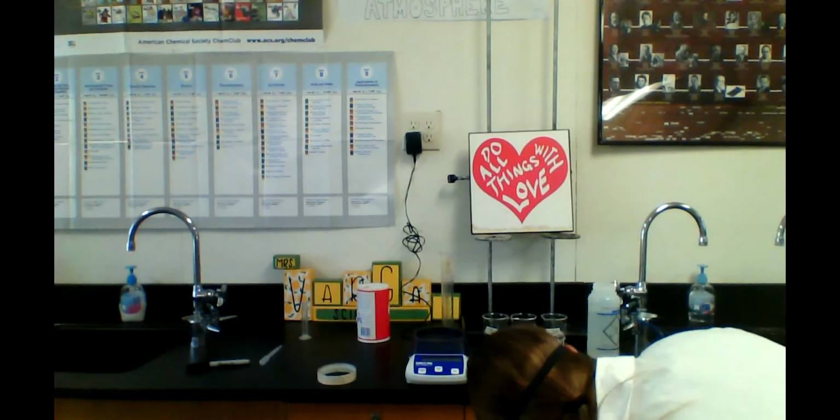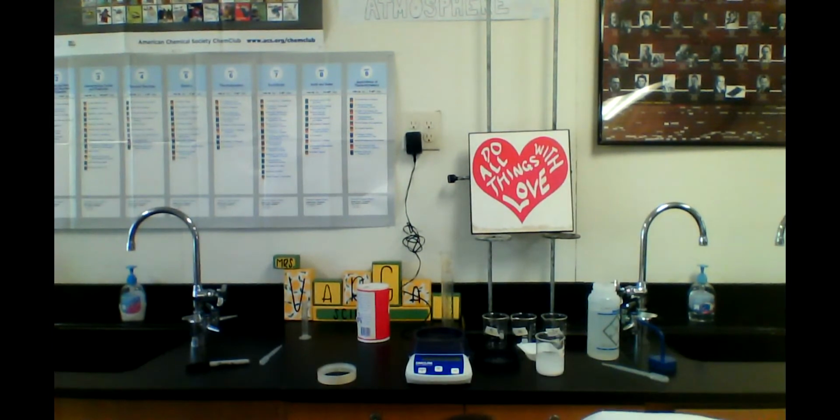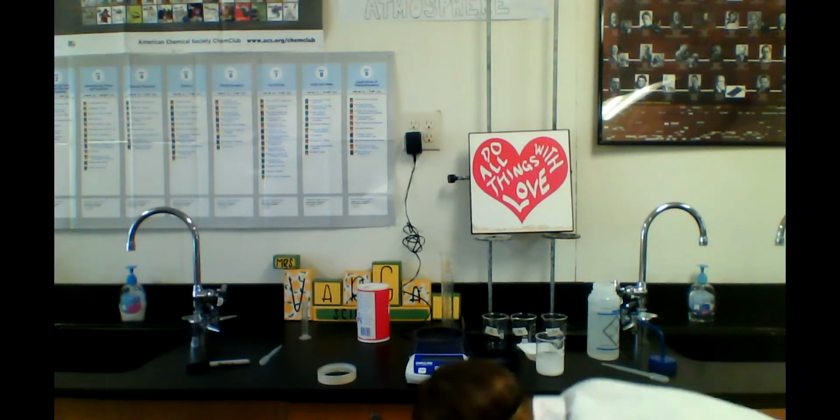Okay, we're going to need to give this a good stir. Let me get the stir rod out, or we can use a scoopula as well. Let's give that a really good stir. Okay, so we need that to be completely dissolved before we start making our dilutions.